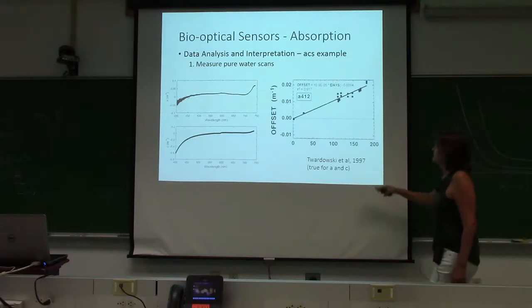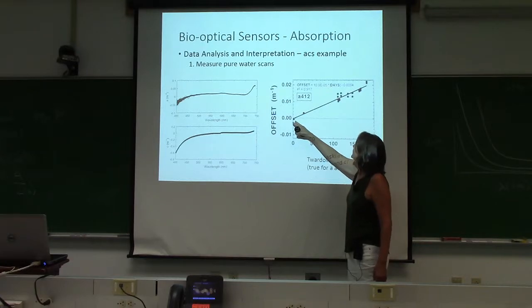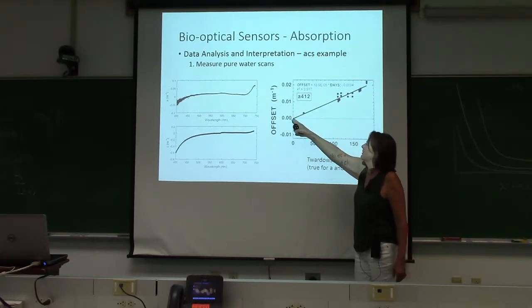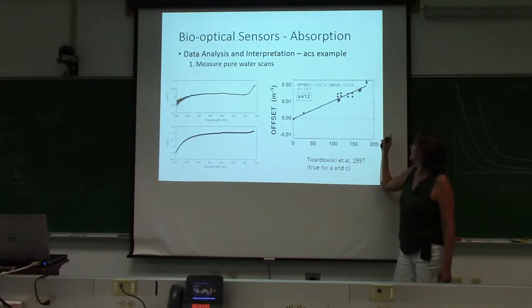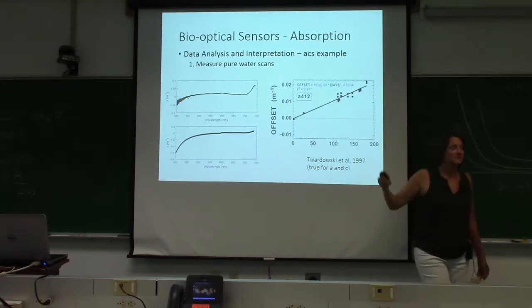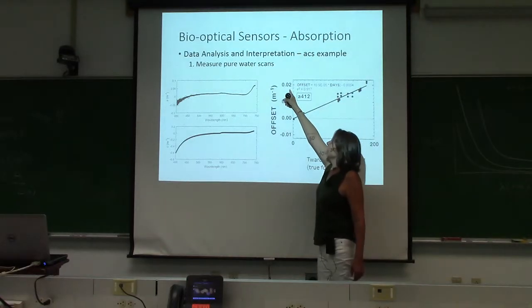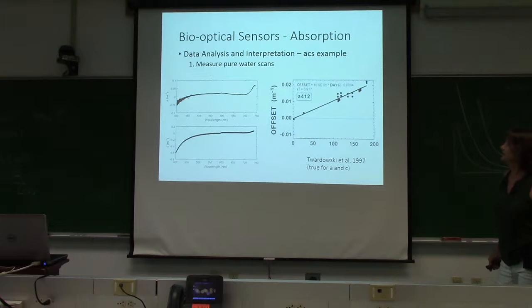And in fact, Mike Twardowski published a paper where he looked at one of the channels at 412, the deviation from the factory calibration as a function of time, and found that, you know, over a year, you have a pretty huge drift. And so you just need to make sure that you calibrate. You'd be off by 0.02 per meter. And depending upon your environment, that can be a really significant amount of signal.